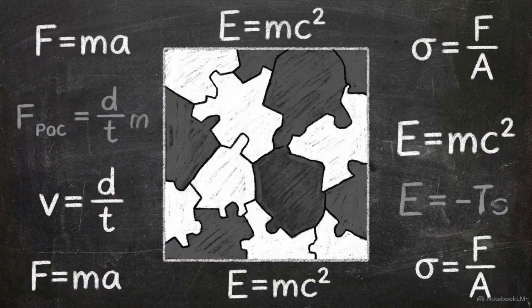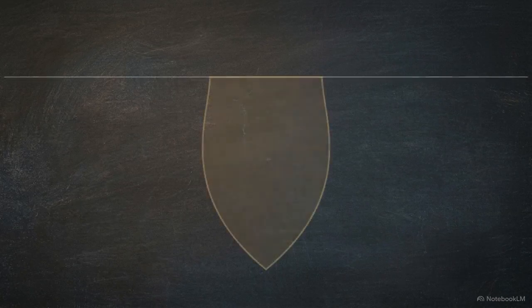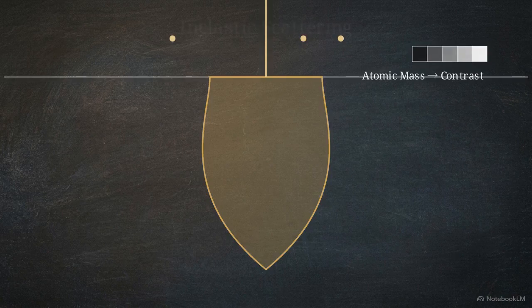By calculating the volume of returning electrons and assigning them brightness values, the microscope draws an accurate chemical map at sub-micron resolution. This isolates complex intragrain variations, such as a lattice of heavy iron-rich orthopyroxene exsolution neatly partitioned inside a lighter clinopyroxene host. Backscattered electron imaging reaches into the deep elastic interaction volume and translates atomic mass directly into visible contrast. We contrast that with inelastic scattering.